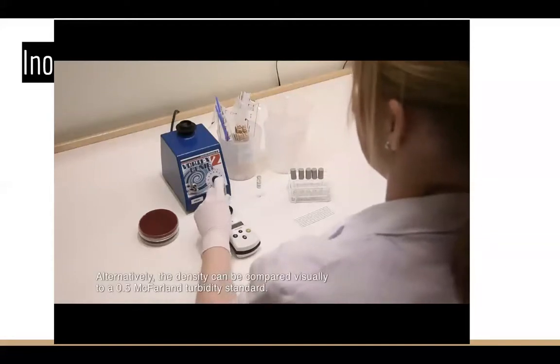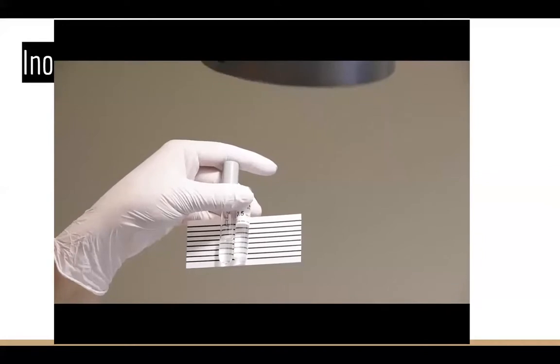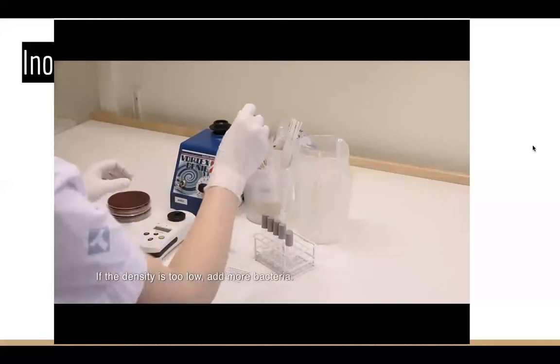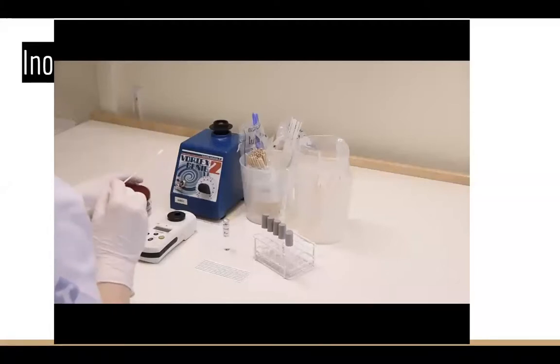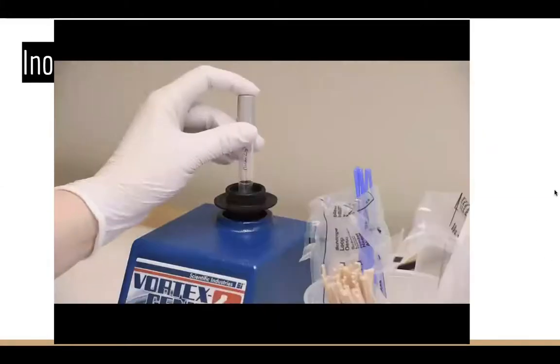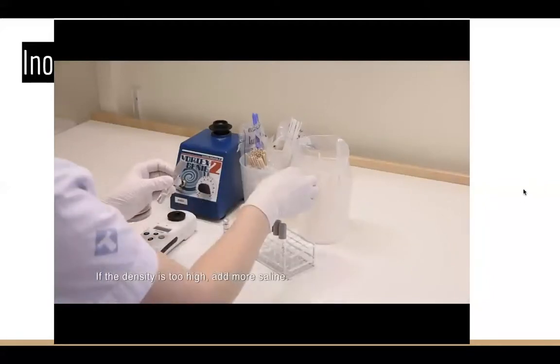Alternatively, the density can be compared visually to a 0.5 McFarland turbidity standard. If the density is too low, add more bacteria. If the density is too high, add more saline.